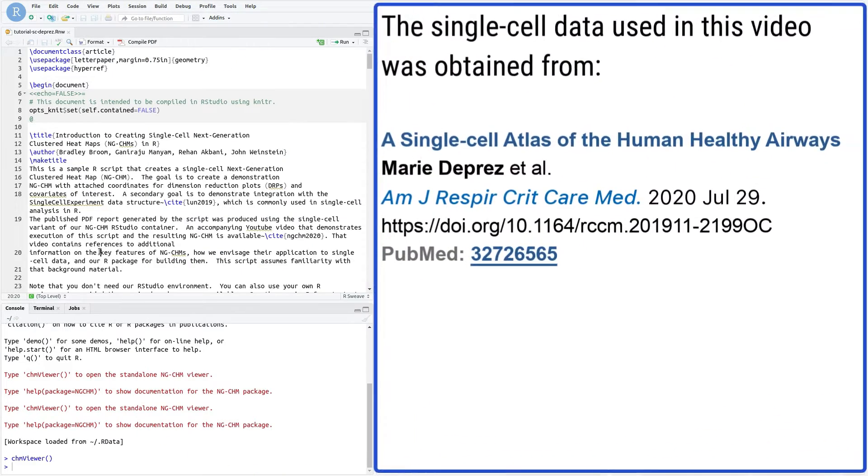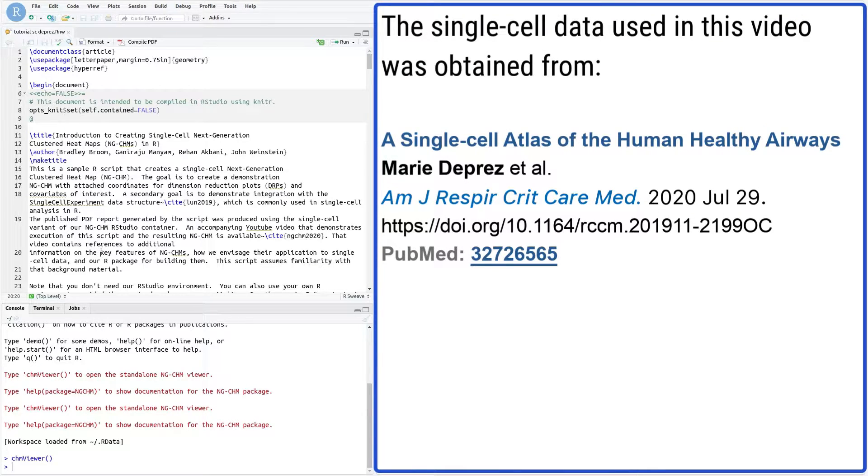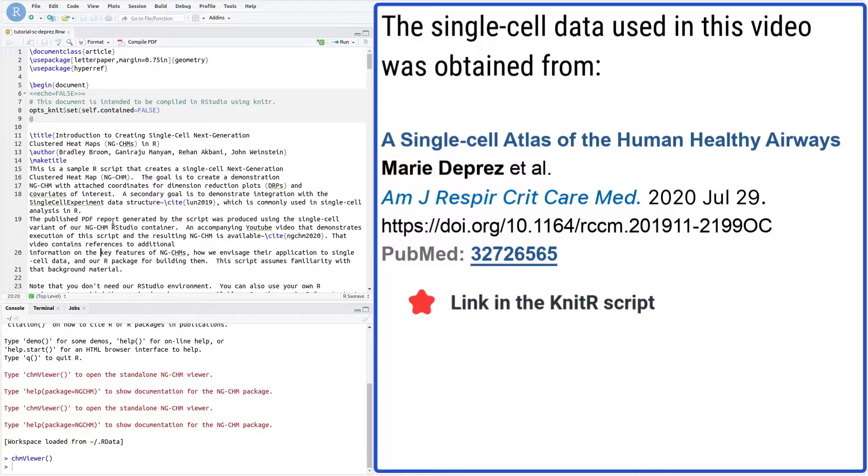The data used to create the heatmap was obtained from the paper A Single-Cell Atlas of the Human Healthy Airways by Marie Deprez et al. 2020. Links to the paper and the data download location are included in the KnitR script.